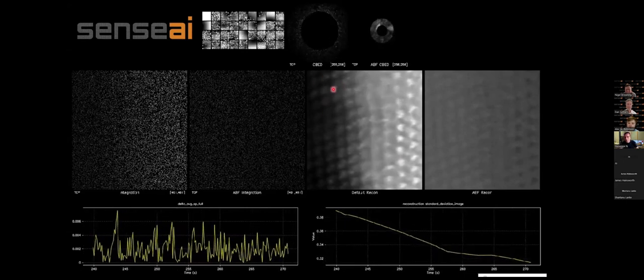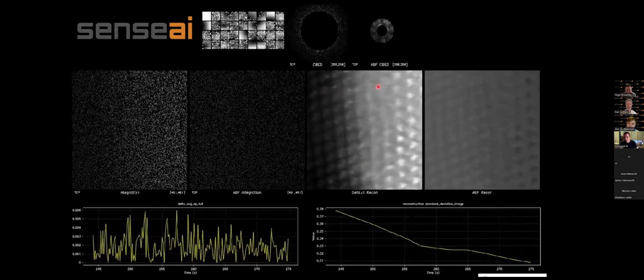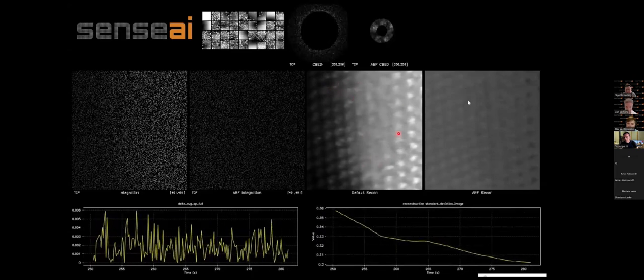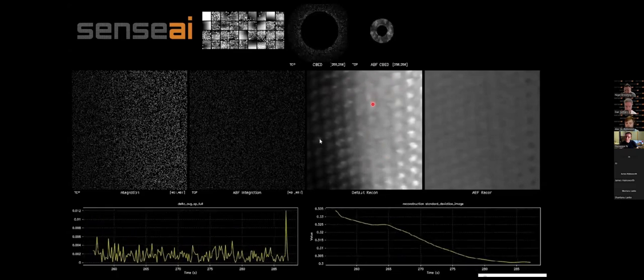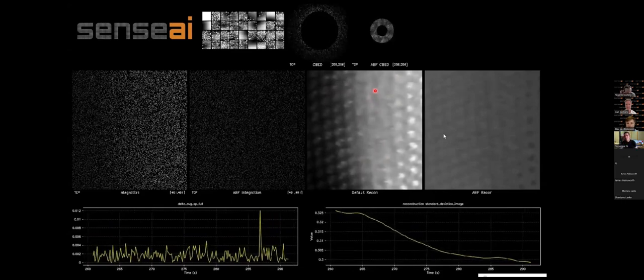You'll start to see now, if you look here, here we have what we believe to be a tellurium atom jumping into either an interstitial or a substitutional defect as this grain boundary is starting to degrade. So as Nigel said earlier, when we've increased magnification, we've increased the density of sampling around the grain boundary.